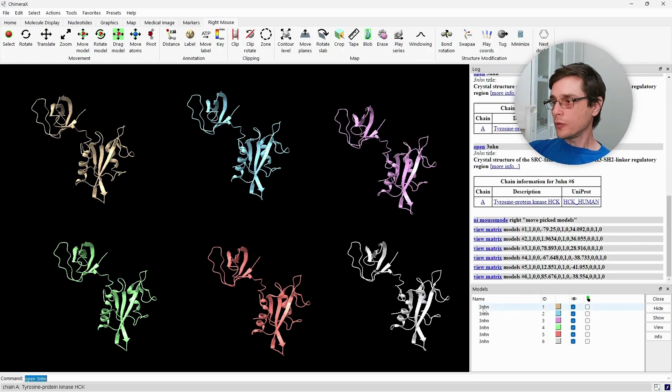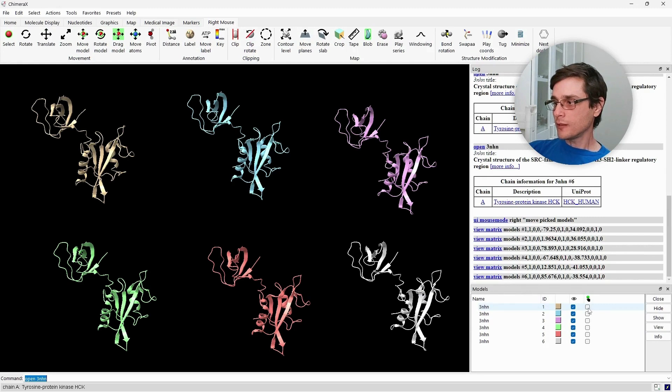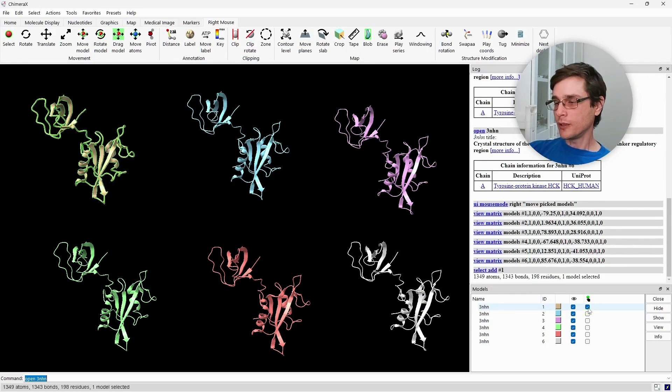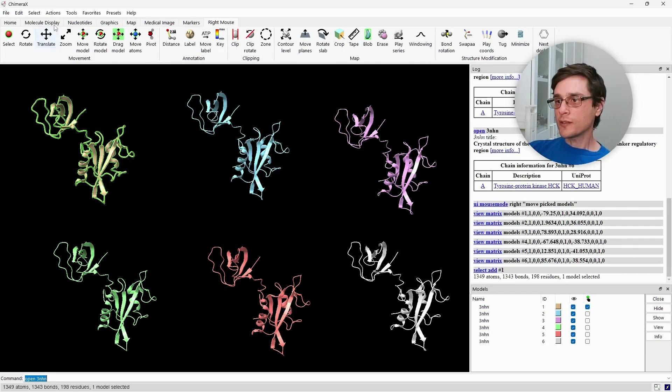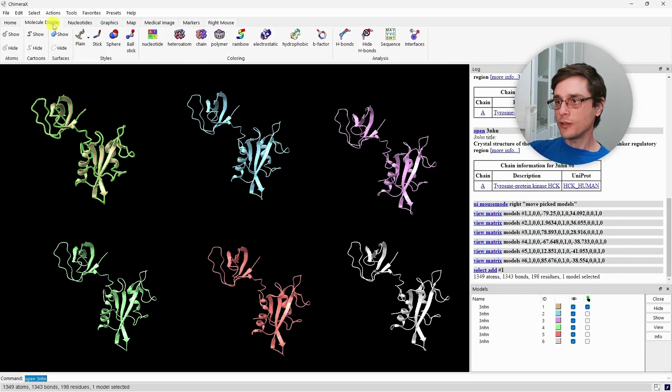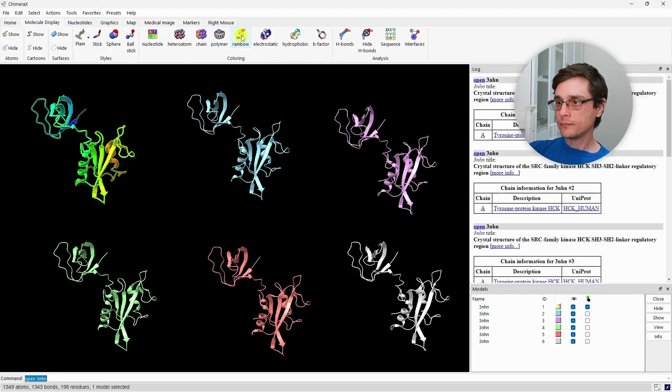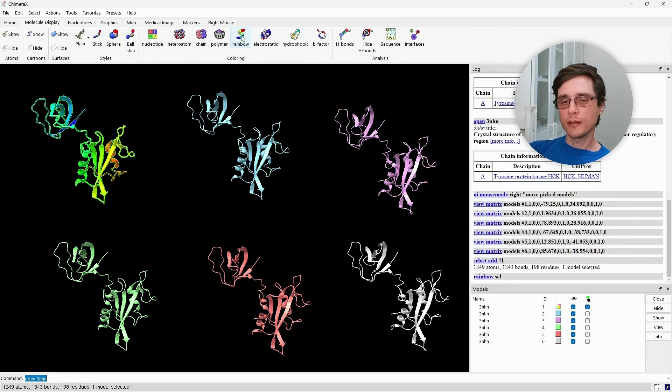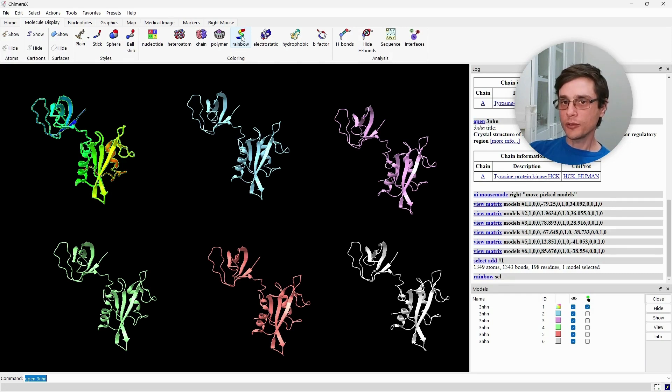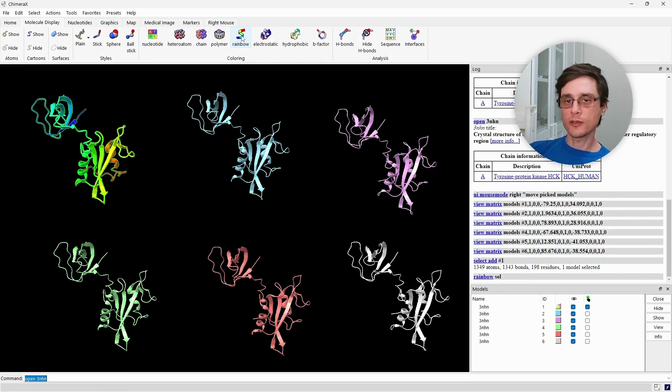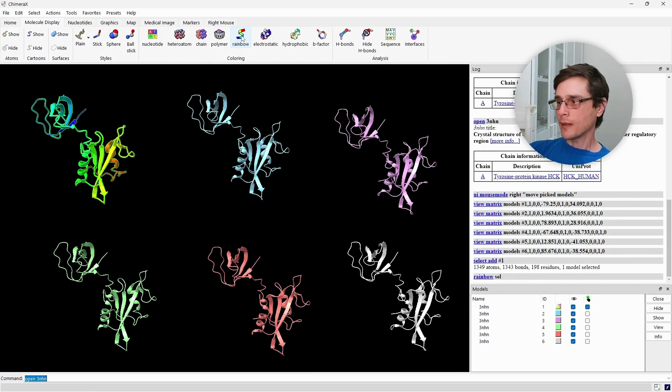First, we'll select the first model. We can do that using this checkbox near the model name in the models panel. And to get started, we'll just change its color scheme to rainbow. The rainbow coloring is good to understand how the structures of the protein correspond to the primary sequence of the protein.